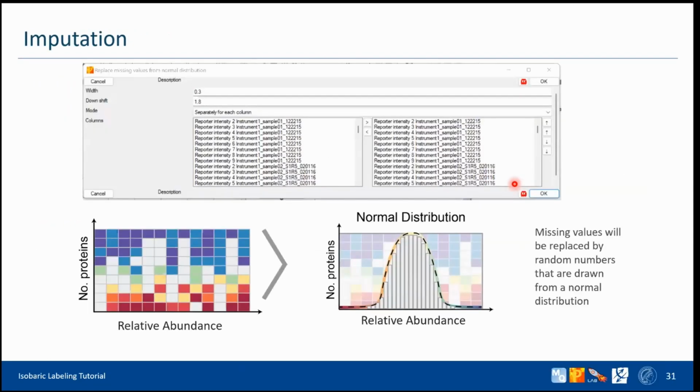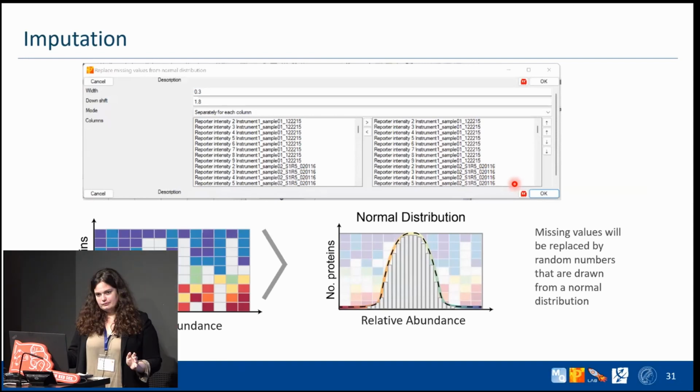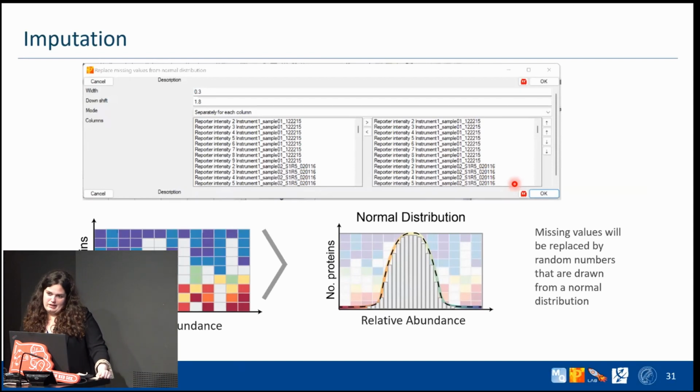Now we have this big data, and we need to see the difference across these different runs in MaxQuant. I showed something similar yesterday with MaxQuant Atlas, where there was this high dimensional data that we needed to reduce to low dimensional data. In order to reproduce it, you can apply a dimensionality reduction. But the problem when you apply a dimensionality reduction is that you need to remove any kind of missing values. So which are the options?